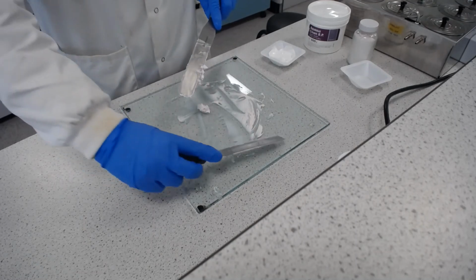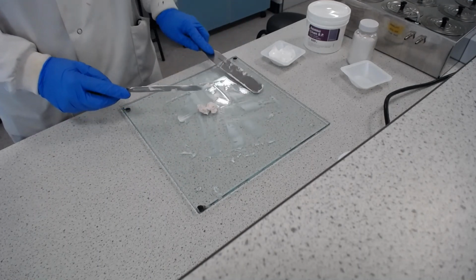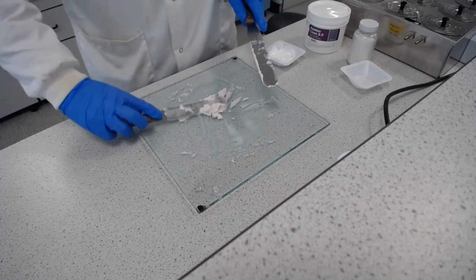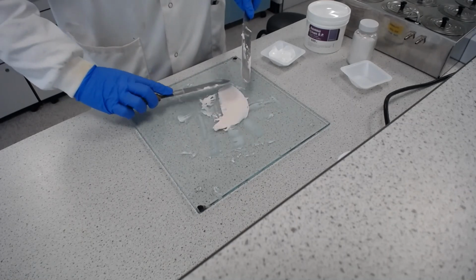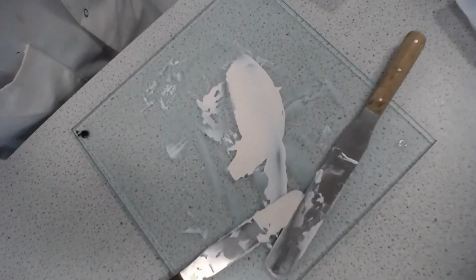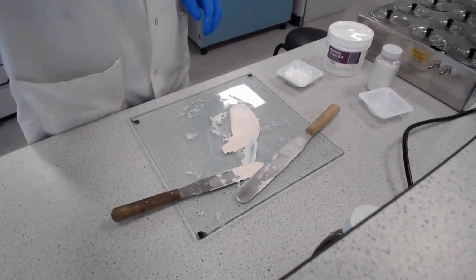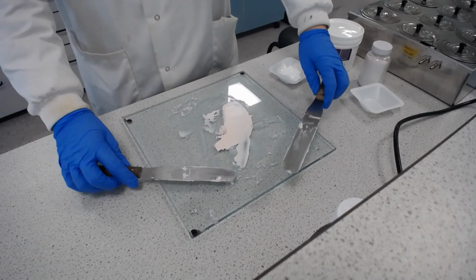So just gathering up from the tile with the palette knife into the middle, so I can see how I'm getting on. Right, that's really nice. So hopefully you can see there that I've got quite a nice smooth paste going on. And we can see that it's turned pink because of the calamine in there.